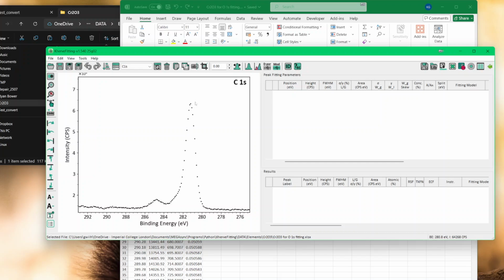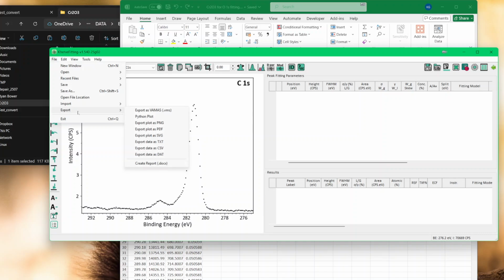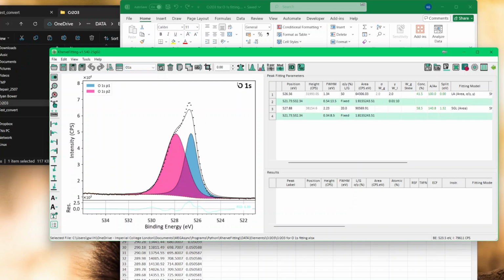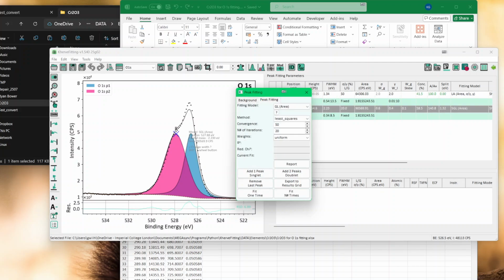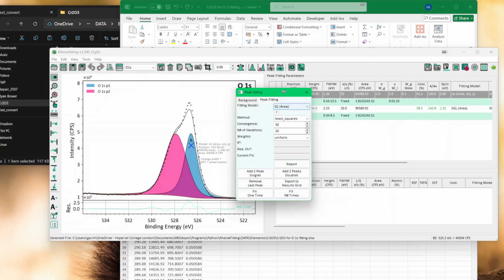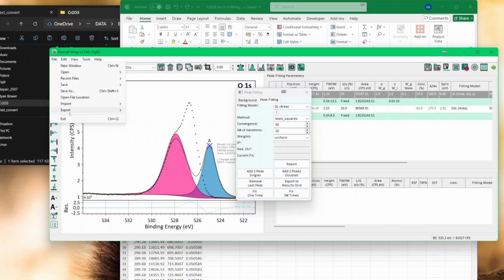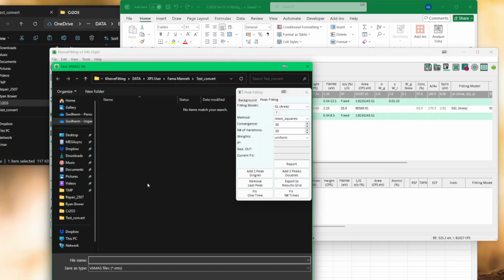But what I've done with the export, because you can now export VAMAS, you can see here the export VAMAS. If I now change the fitted file, I will move this one somewhere else, to show that something has happened. So this is my LA50, and I moved it, and I'm going to export that into a VAMAS. I will call it test convert.